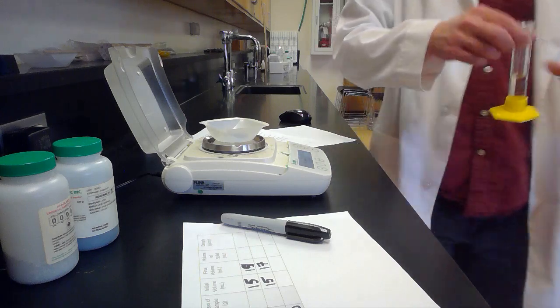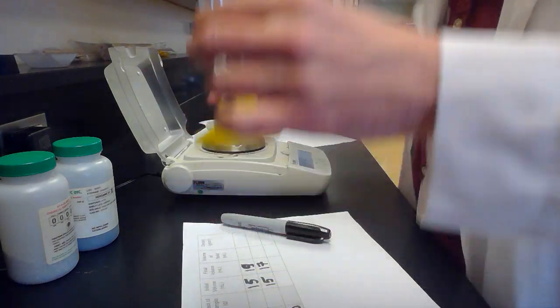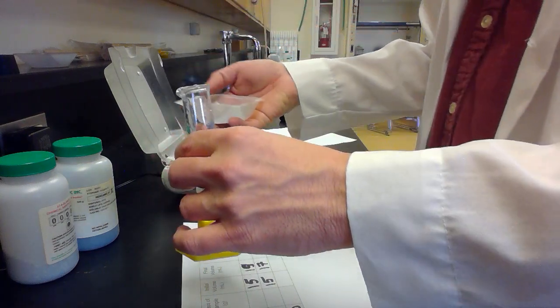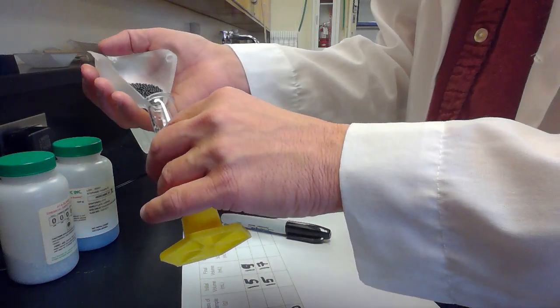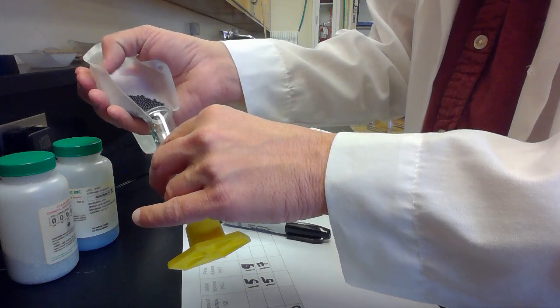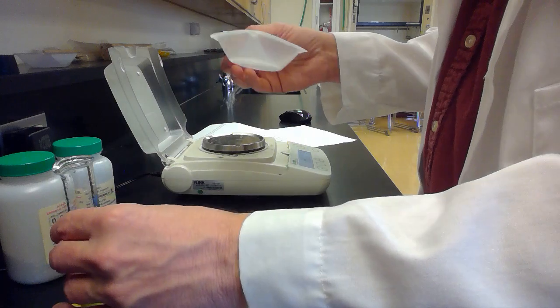Okay. I'm going to say that's pretty close to 15 right there. And then we'll put our 43 grams of lead in there. Well, this is actually more like 41 grams of lead because the weighing dish weighs 2.40. So being very careful not to spill lead all over the place because it will run everywhere if I do. Here we go.